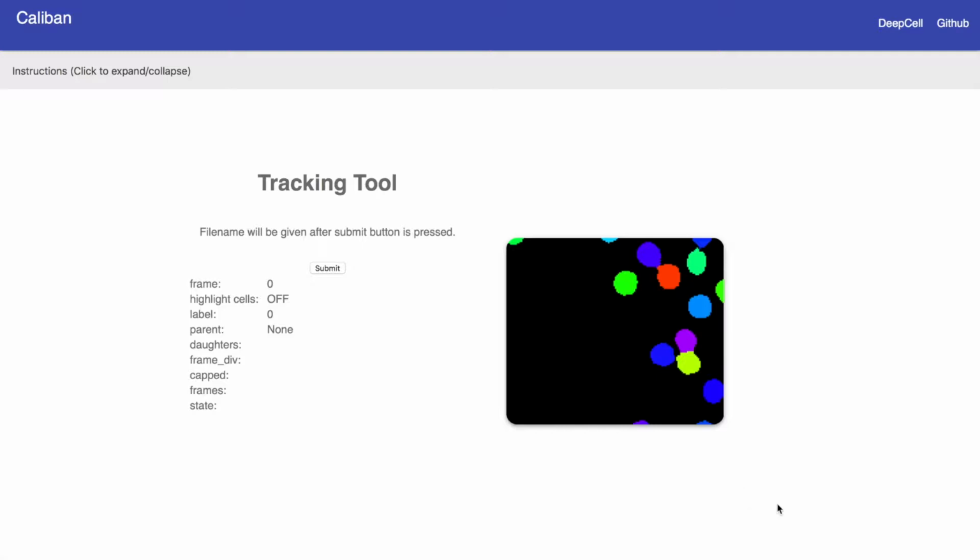To do this, we have turned some of these microscopy videos into sets of images and need your help in making sure that each cell has a proper label and lineage information. If the cells are labeled well, the computer program can learn how to label and track the cells by itself.